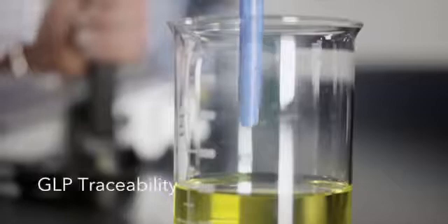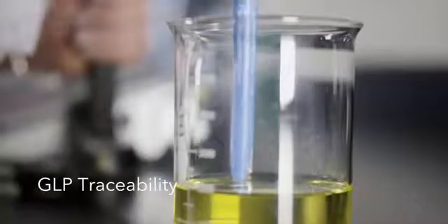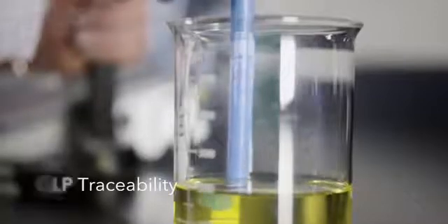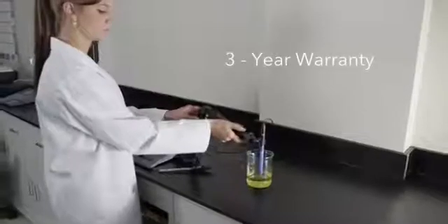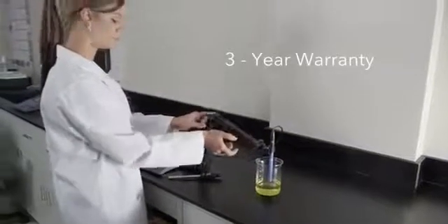All models come standard with GLP traceability, sensors that store serial numbers and calibration data, USB connectivity to manage data, and a three-year warranty.